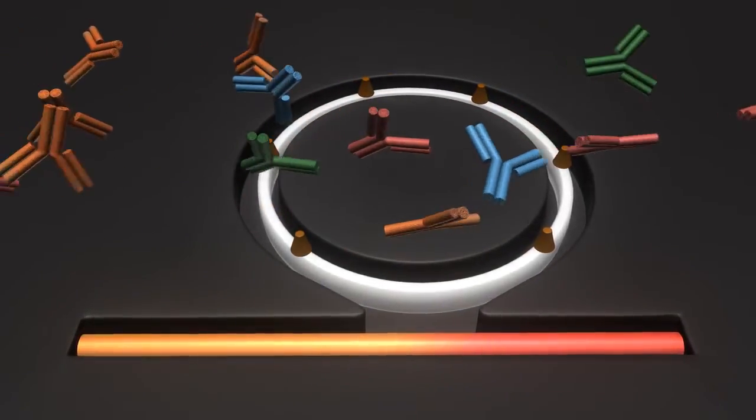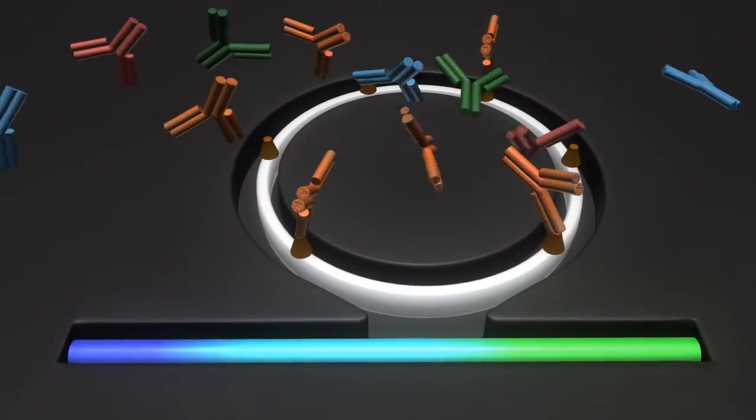Light passing along a linear waveguide is trapped by the ring sensors at each ring's resonant frequency.